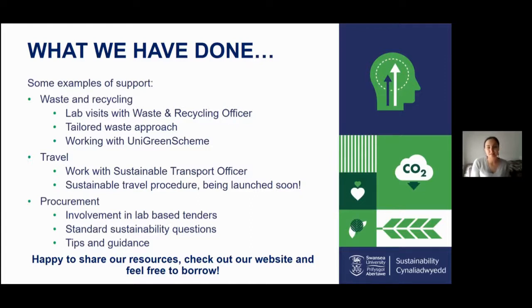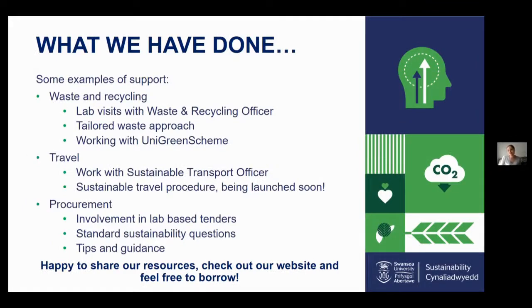There are sustainability standard questions, and we're supporting groups now when they are buying specialist bits of equipment. We've got a bit of a database of questions that are forming that we can send out to people as examples they can use within their tenders. So as I've said, we're happy to share our resources if you need any help with that.